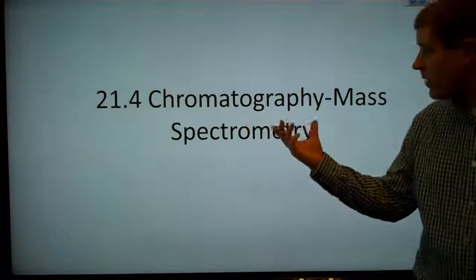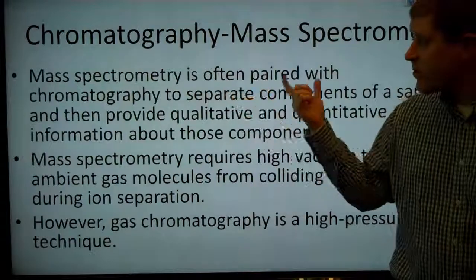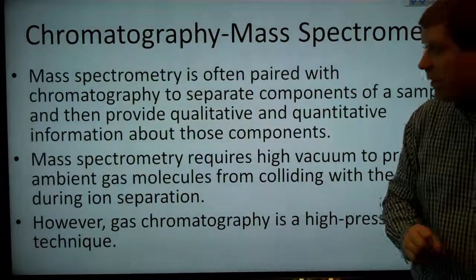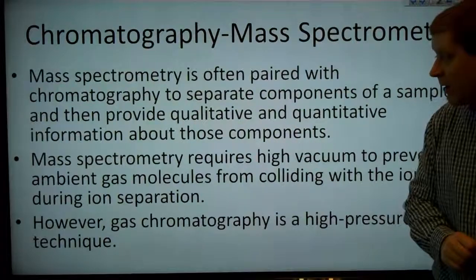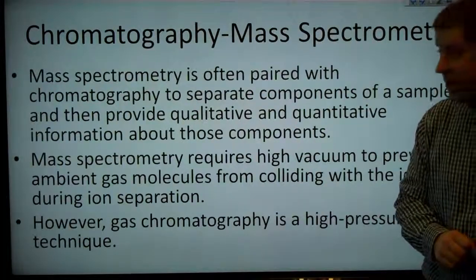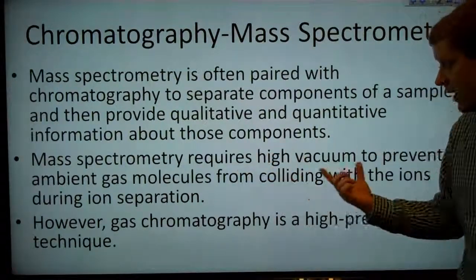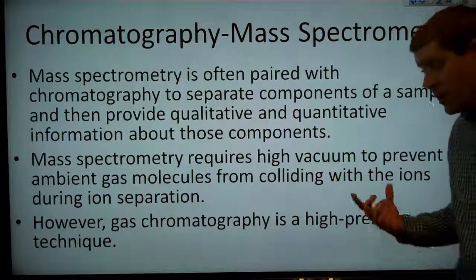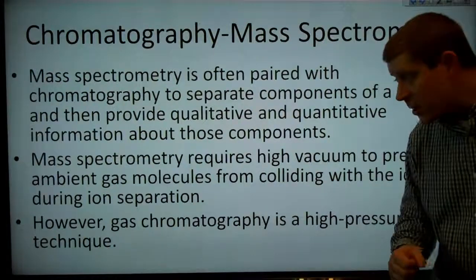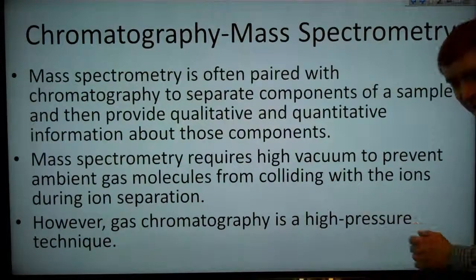Welcome to Chromatography-Mass Spectrometry. So mass spectrometry is often paired with chromatography to separate components of a sample and then provide qualitative and quantitative information about those components. Mass spectrometry requires high vacuum to prevent ambient gas molecules from colliding with the ions during the ion separation, but gas chromatography is a high-pressure technique.